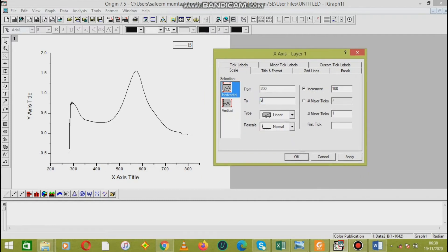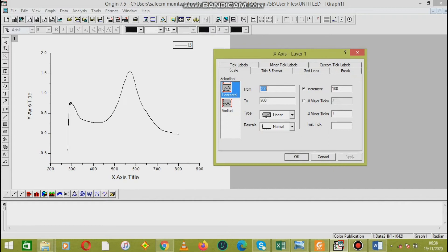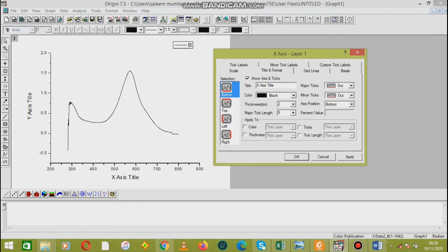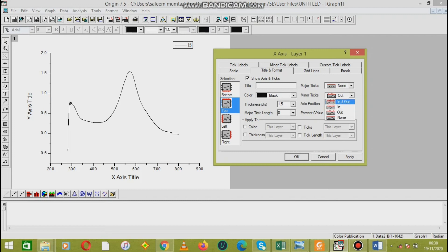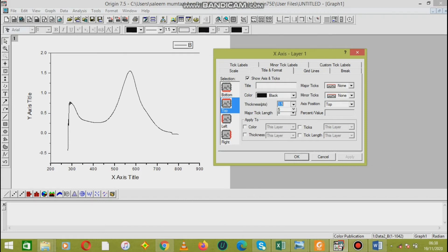Now we move towards the axes from the top and from the right side. We change the thickness to about two, and from all sides we change the thickness of the graph to about two.